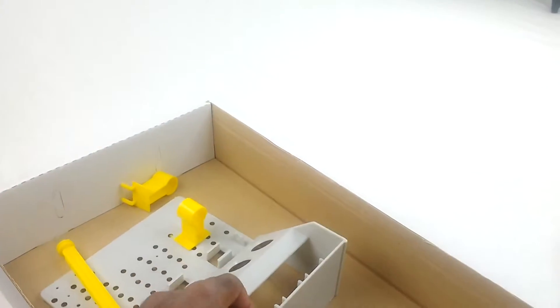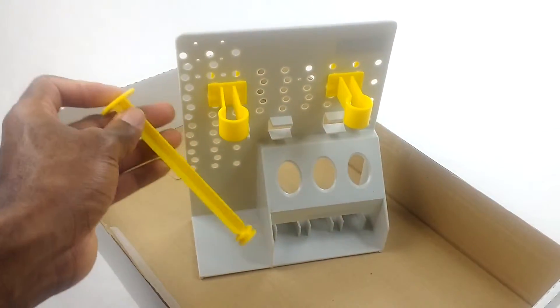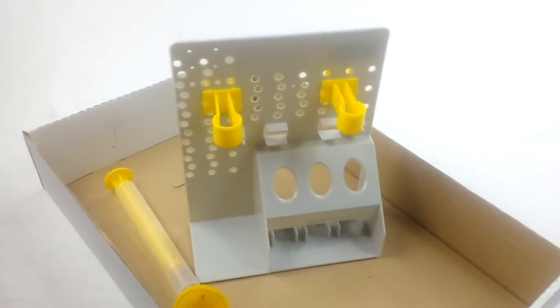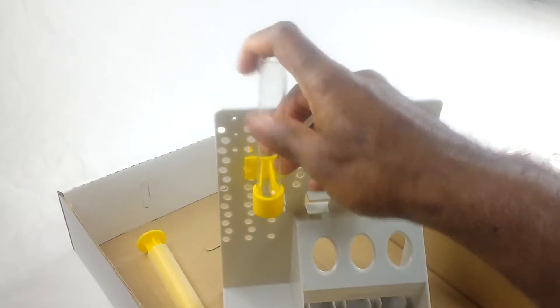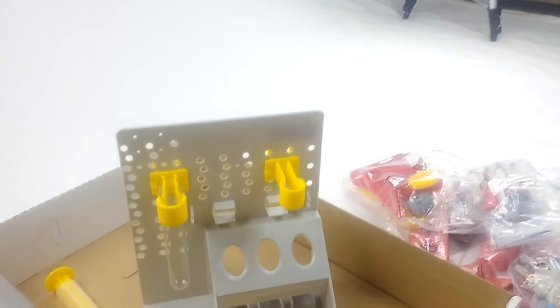The rest of what's in the box is just a little stand-up shelf where you can put your scientific tubes. I'm not sure what this other piece is — I guess it's supposed to go in there. Let me get a scientific tube to show you. This is what you do: you just slide your tube in there and do your little experiment.